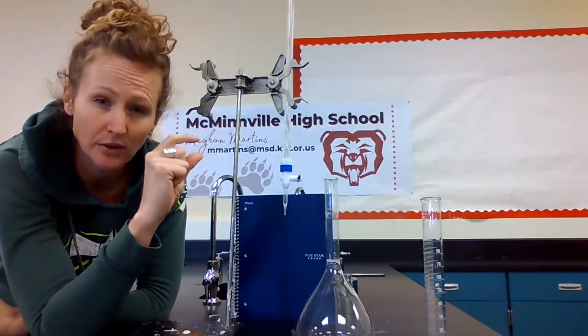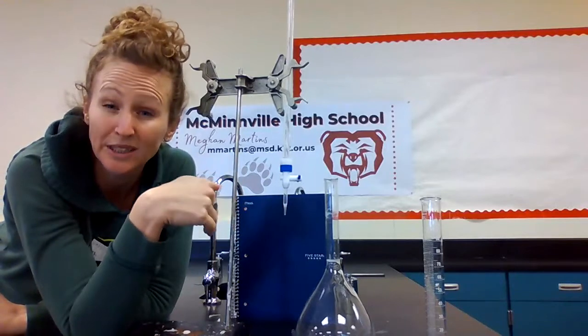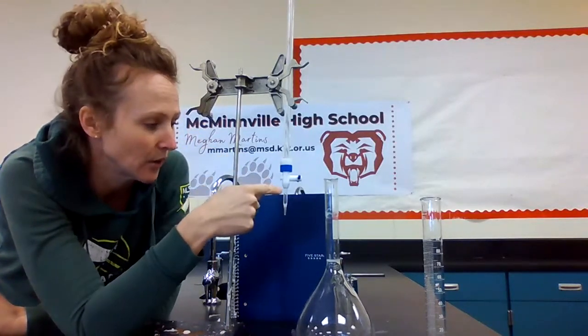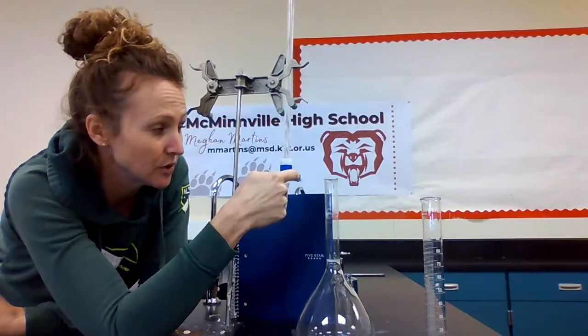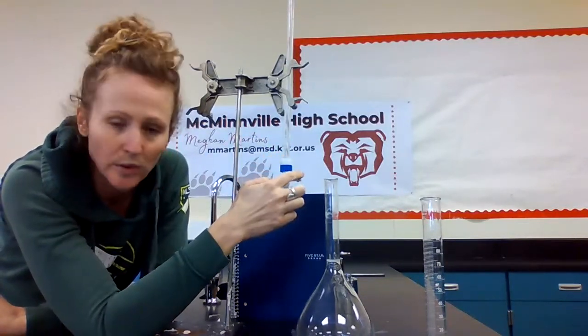A burette is really good at adding very small amounts of volume and very uniform amounts of volume. So we can add a drop, and each drop is fairly equal to the next drop, which is a power of a burette. This is called a stopcock. Right now it is closed. If you turn it so it's pointing up, it is open. And this is what we use to control the flow of solution out of our burette.